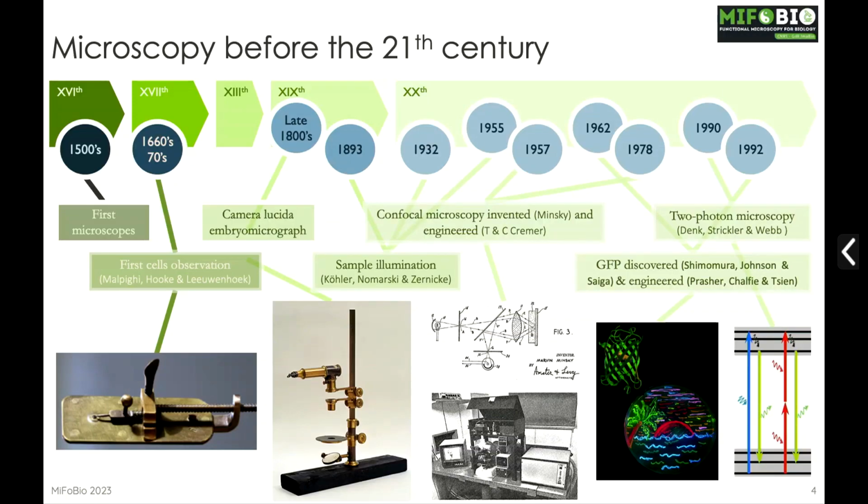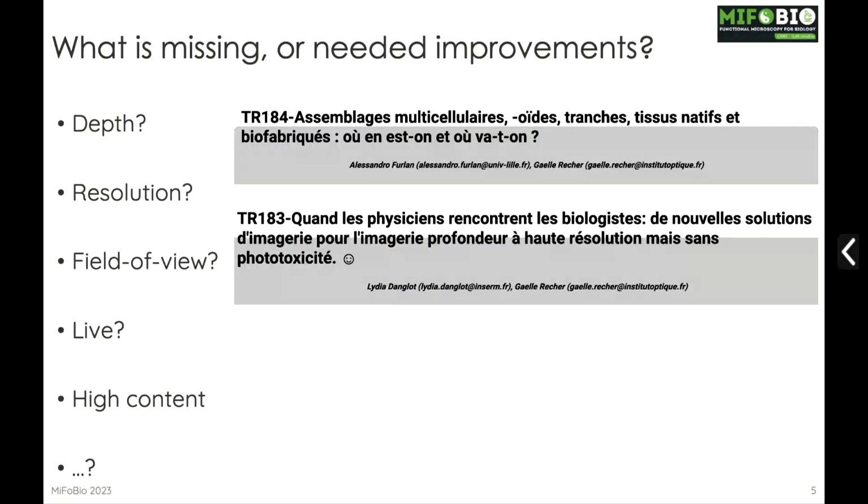And then, as Hervé stated, there was the reign at some point of the two-photon microscope, which was really a game changer in terms of depth penetration and all the new modalities that you can have. So when we start the 21st century, we can have a bunch of questions. For example, what do we want next? Do we want to go deeper into the tissue?